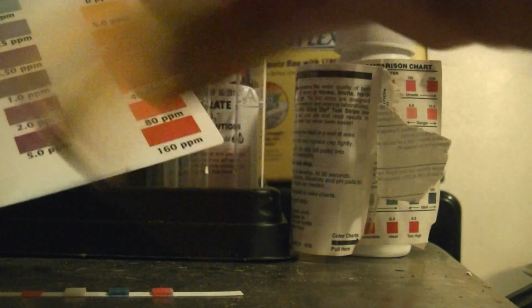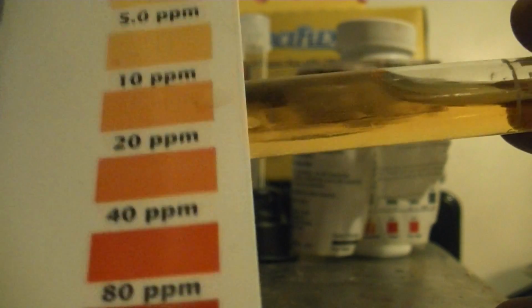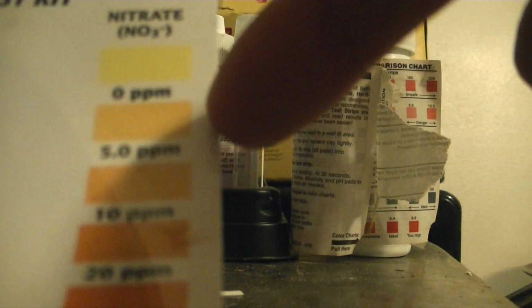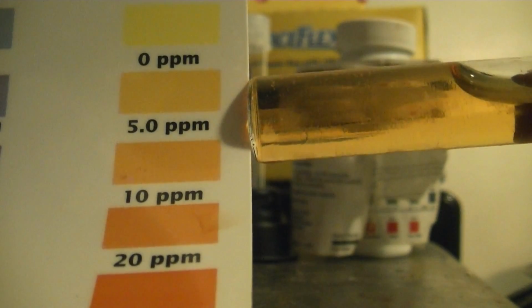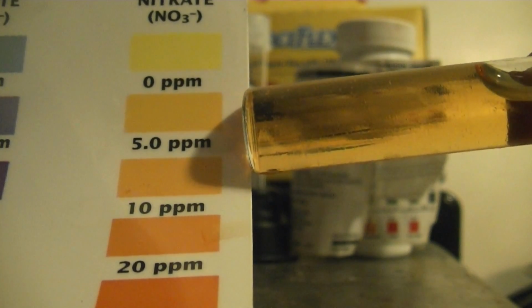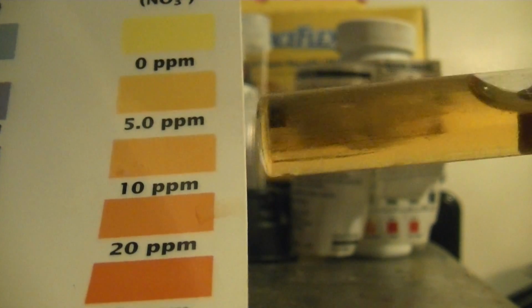Trying to go slow just so this has time to fully change if it's going to get any darker. But this, I'd say right now, is showing, this color right here is 5 parts per million, this is 10 parts per million. I don't think we're any darker than 10 parts per million, because this would be 10-20, and I think that's too dark. So we're showing 5 to 10 parts per million, whereas my test strip showed 40. So see how much a difference that is?